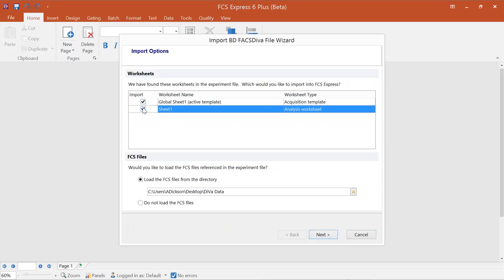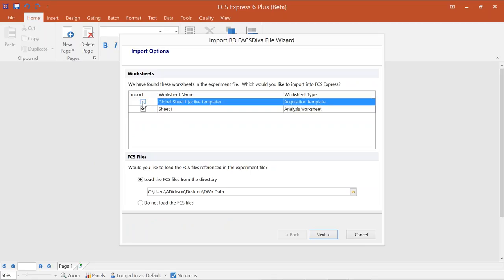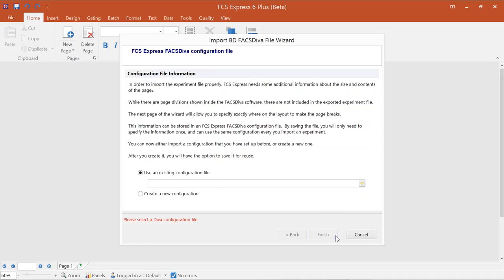If you're using global or normal worksheets within FACS DIVA, you can import any or all of them into FCS Express. For simplicity, I'm only selecting the second sheet. For FCS files, you can choose to load the associated files from the directory where you exported them, or choose not to. We'll load them at the same time and click Next. You'll then be prompted to choose a configuration file — this defines the page breakdown, divisions, and layout from DIVA.